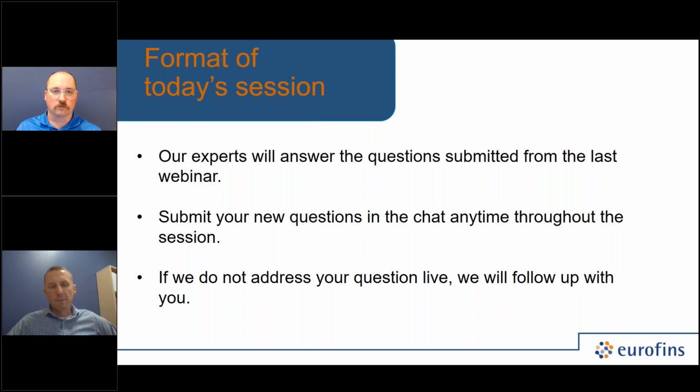Okay, good. So I'm glad you came back to it at the end. So the 10 to the 5th, 10 to the 6th, even 10 to the 7th seems to be where you'd want to be on a per gram basis in terms of being able to reliably get an information value, right? But there are some matrix dependent issues there, which kind of leads us into our next question, which is what type of matrices or finished products have you tested on flow cytometry, and what are some of the challenges associated with those perhaps more complicated matrices?